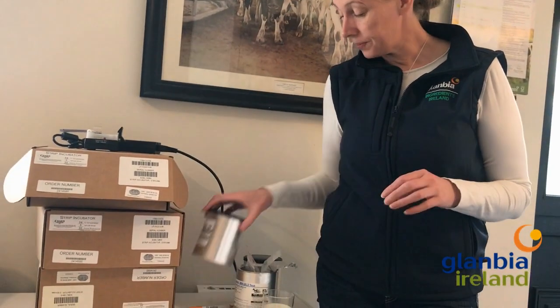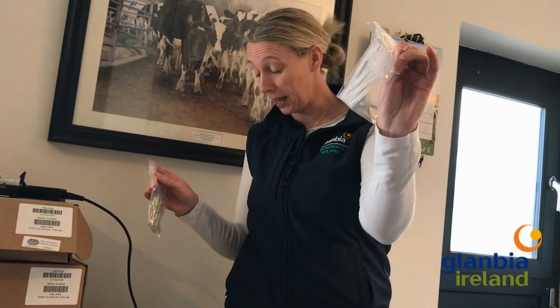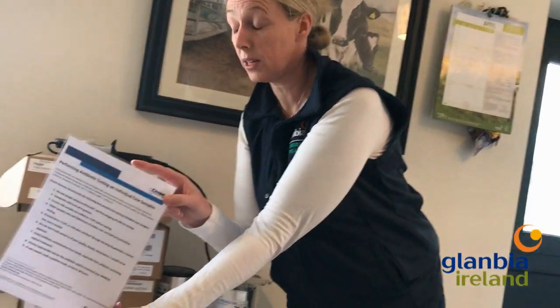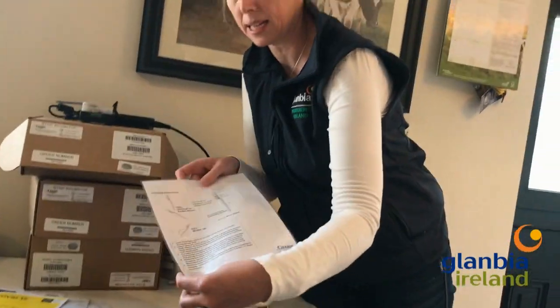What's in the kit? There's a box of charm strips that contains your strips and also your pipettes for sampling the milk. There's all the instructions that you'll need — how to test milk from individual cows, how to read the strip at the end, and also how to use the pipette.